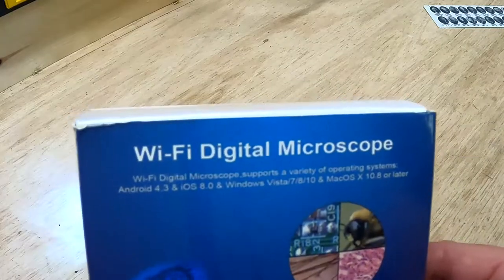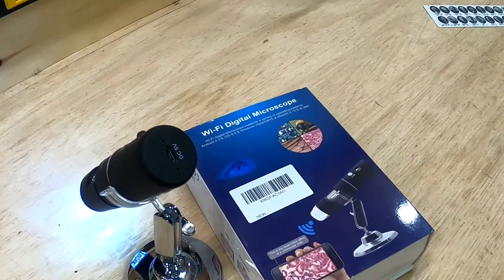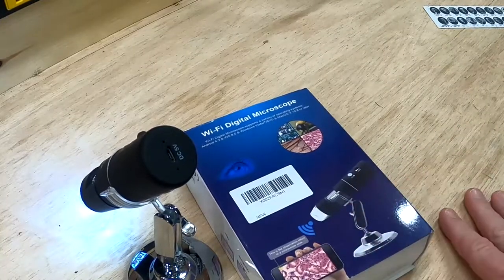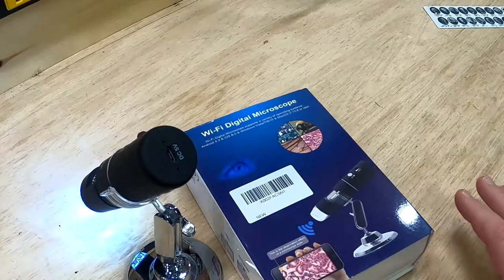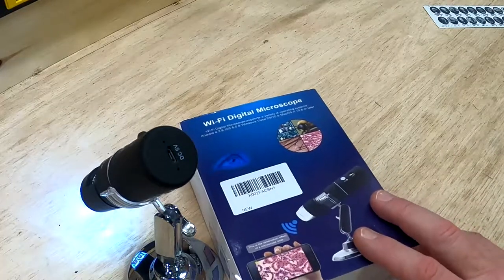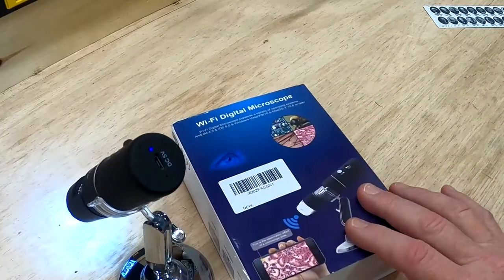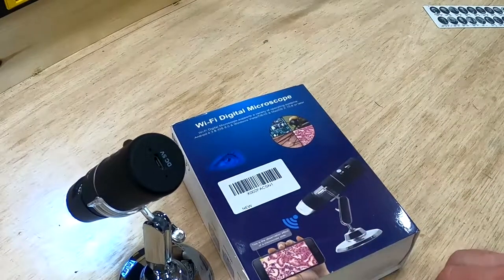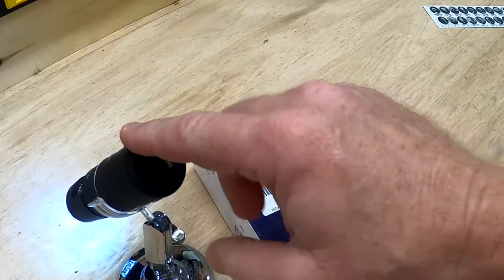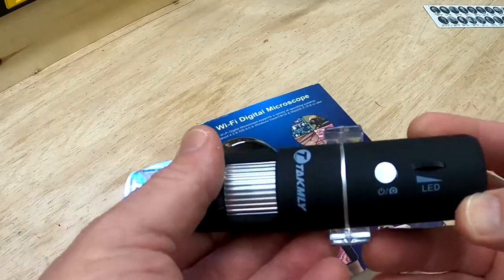This is a Wi-Fi digital microscope. A few weeks ago I did a YouTube video where we did a science project on bacteria, and we had a really hard time identifying the bacteria because we couldn't get a close enough picture. I bought this on Amazon for about $40 and I've been very happy with it. It's great if you want to look at the microscopic world — it's more of a Wi-Fi camera that does a really good job of focusing.